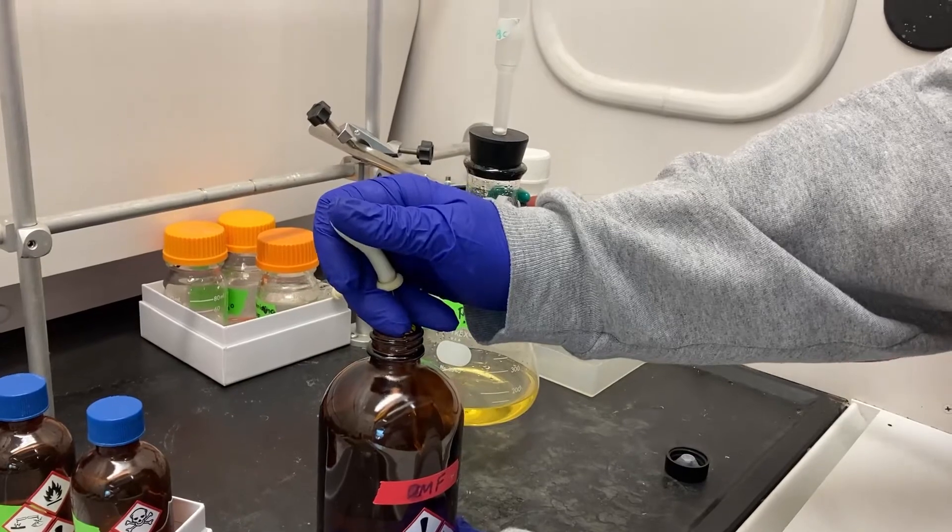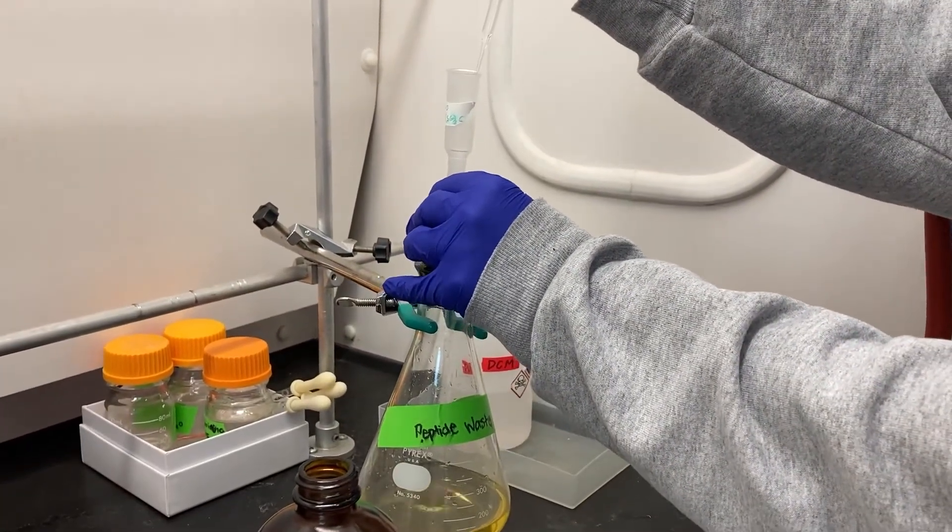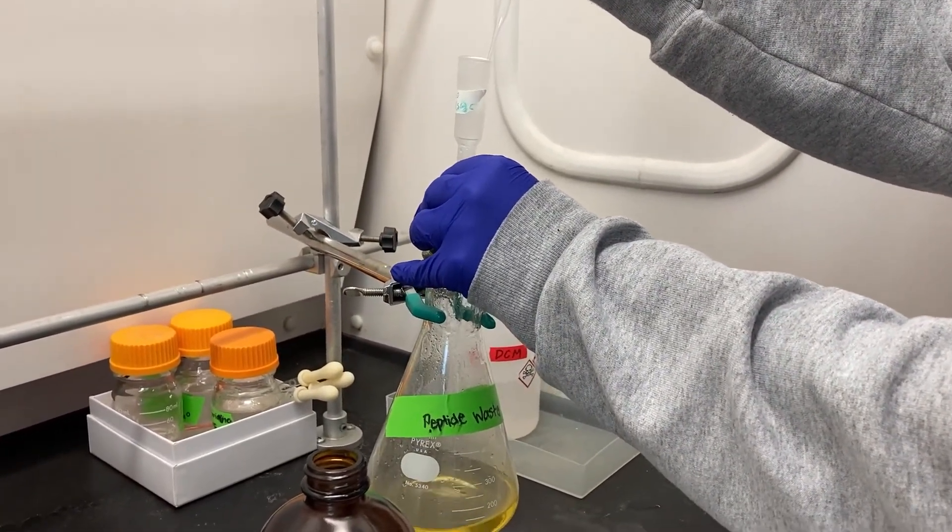Before you store your peptide, wash it with DMF, then wash with DCM. Drying out the resin with DCM will further prevent any undesired reactions.